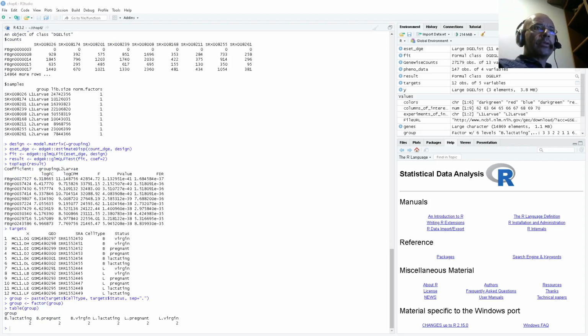We will then proceed to plot the samples and extract scientific value by following a series of instructions.